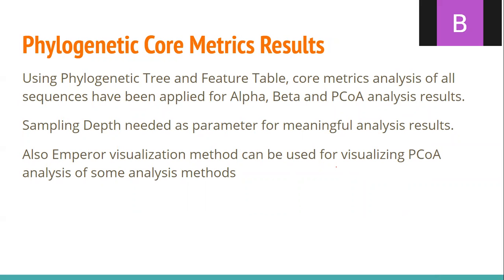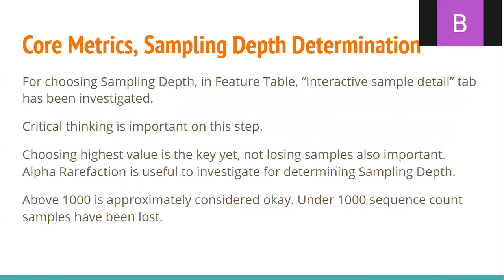This step of getting the sampling depth requires critical thinking. For sampling depth, I first investigated the feature table for how many sequences I count in my samples.